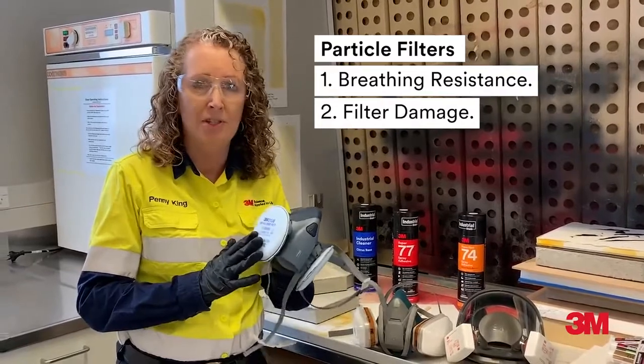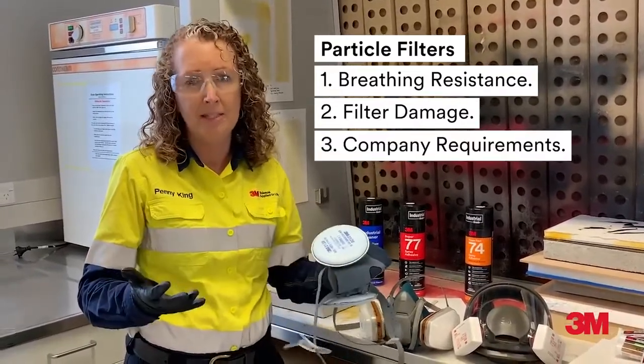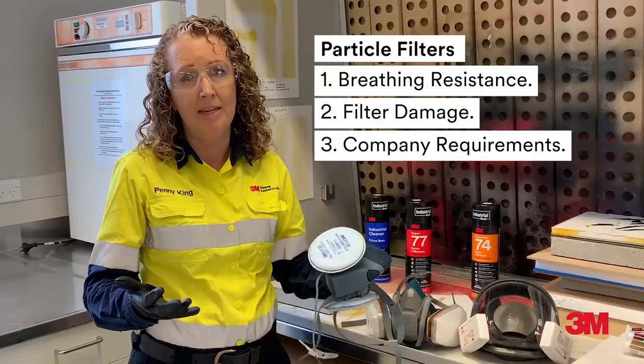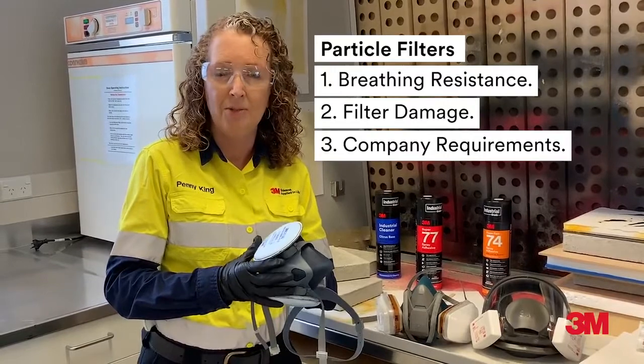Step 2: If your filters have had any damage — this could be burnt or wet. Step 3: For any specific company requirement that you may have, which could involve batch or quality control or a decontamination process.